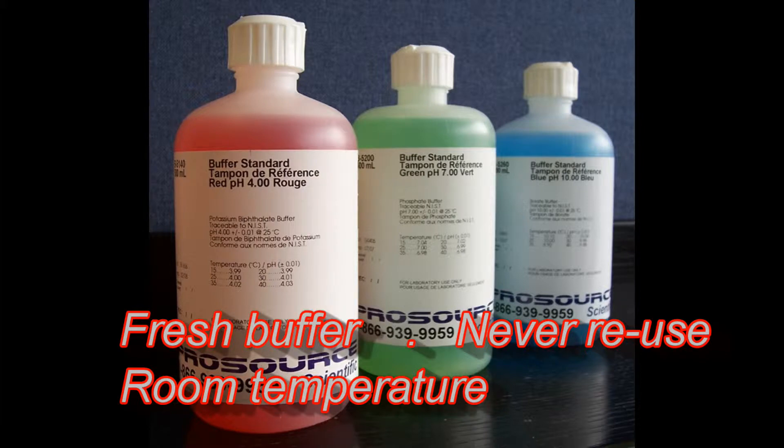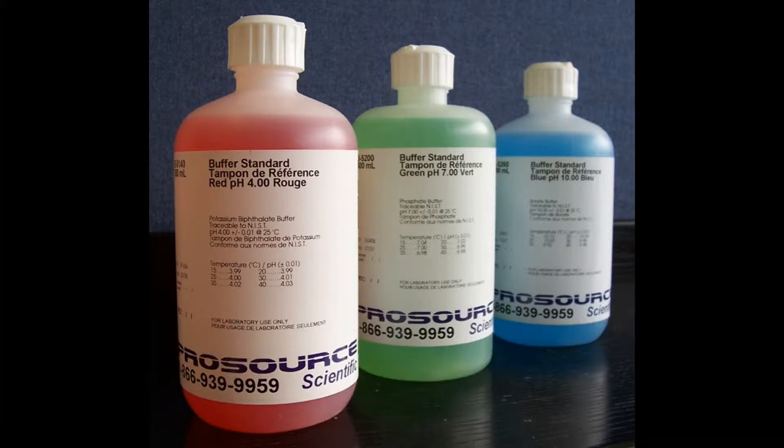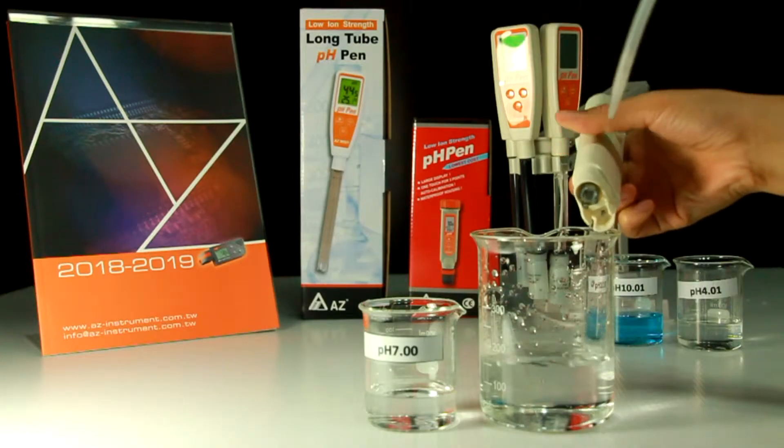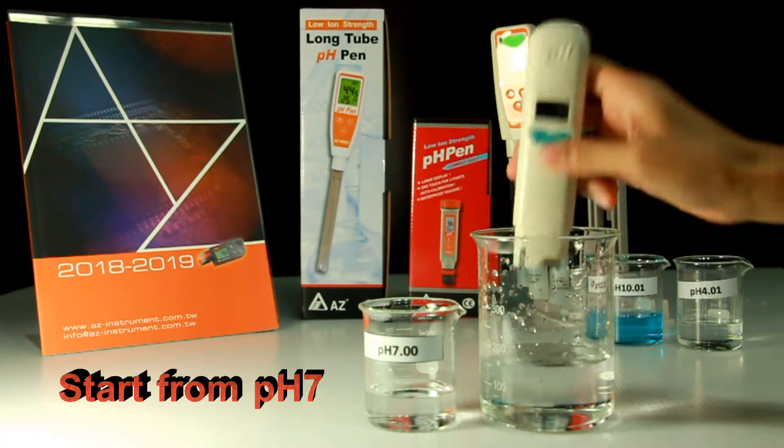It is suggested to calibrate the PH Pen regularly, or you may calibrate it every time before testing to get the best accuracy. A 2-point calibration is a must, and you can increase to 3 points if your testing range covers from acid to alkali. Always use fresh calibration buffer and never reuse it.